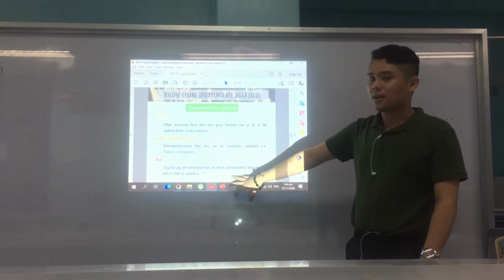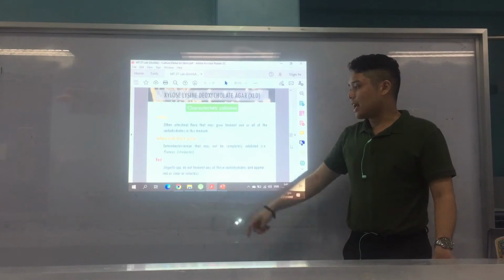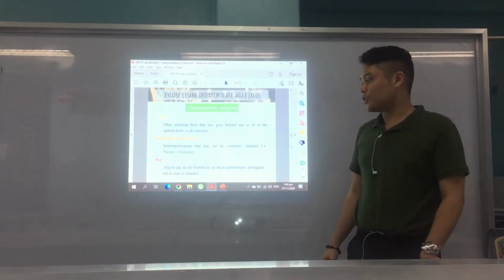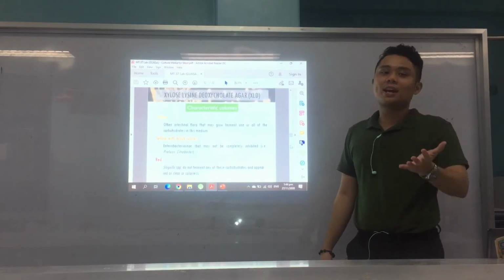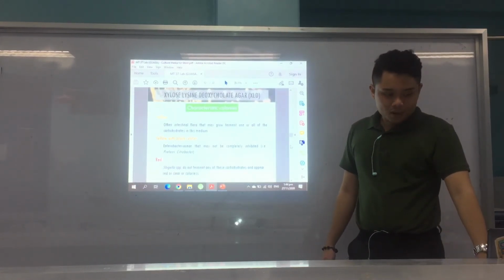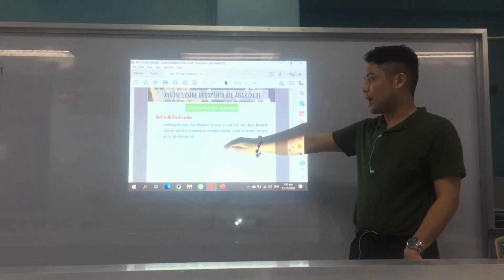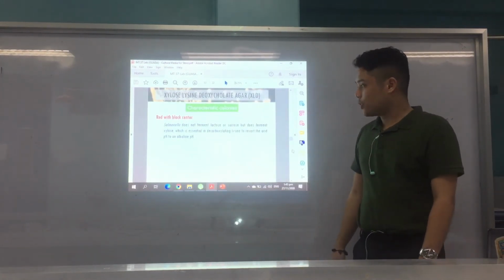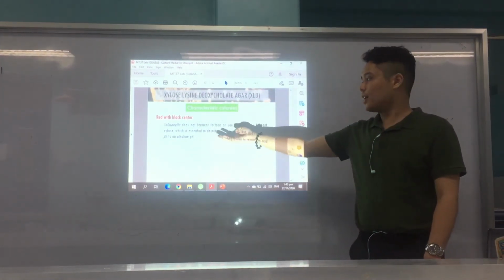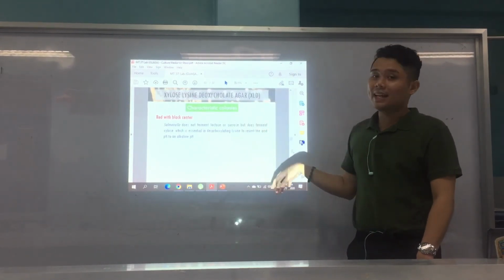And of course, red, one of the characteristic or significant dyan nato is Shigella. Shigella do not ferment any of the carbohydrates and they appear red or clear or colorless, because Shigella is a non-fermenter of lactose and other sugars. And red with black center, of course, Salmonella, not ferment lactose or sucrose, but it does ferment xylose, which is essential in decarboxylating lysine to revert the acid pH to an alkaline pH.